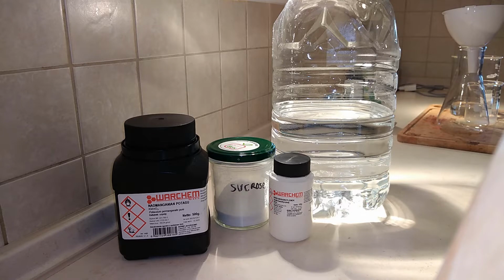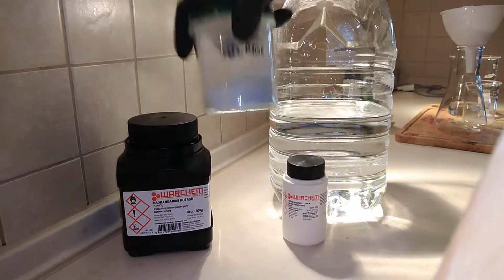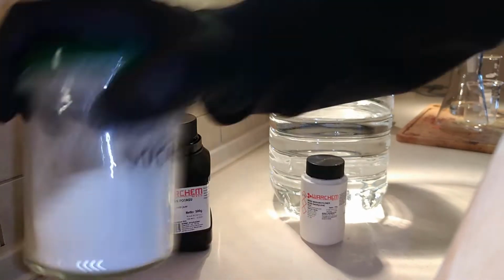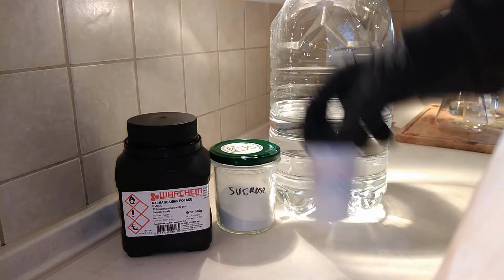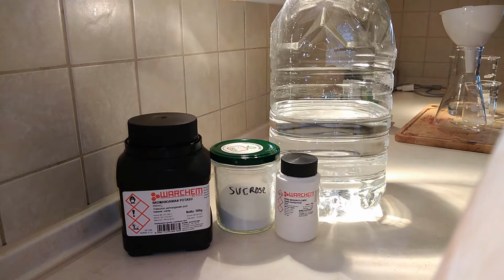Today I'm going to be doing a quick demonstration that's, for me, a perfect example of a redox reaction. For this demo we're going to need a strong oxidizer, potassium permanganate, sucrose, aka sugar, which I have finely ground using a mortar and pestle and a blender lately, and sodium hydroxide as a strong base. You can use potassium hydroxide also, but sodium hydroxide is a lot easier to get and cheaper.